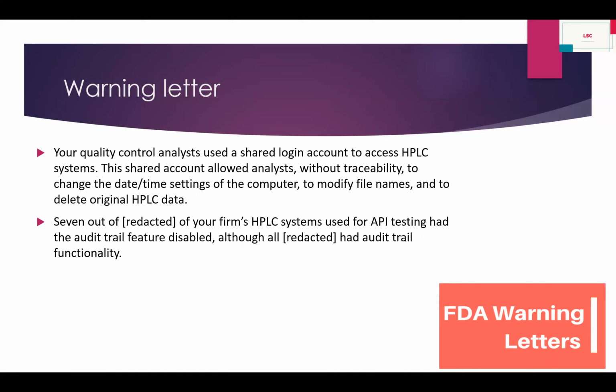7 out of your firm's HPLC systems used for API testing had the audit trail function disabled, although all had audit trail functionality. So if you are in the quality unit, ensure that in your premises, the system should be established in a proper way, as per the required regulatory requirement.